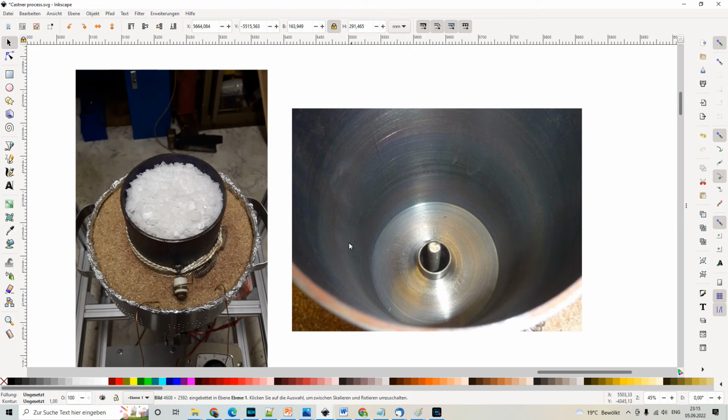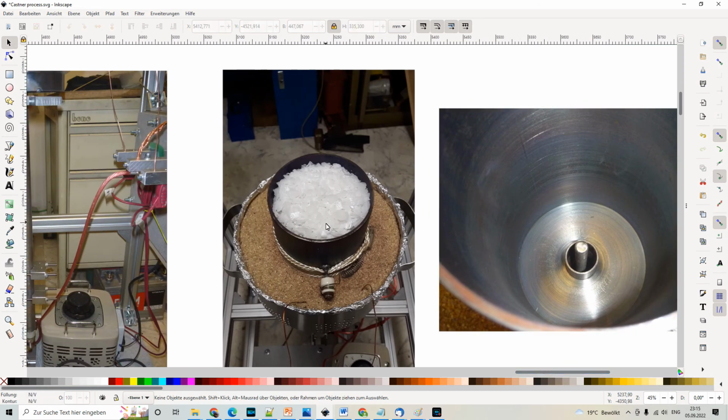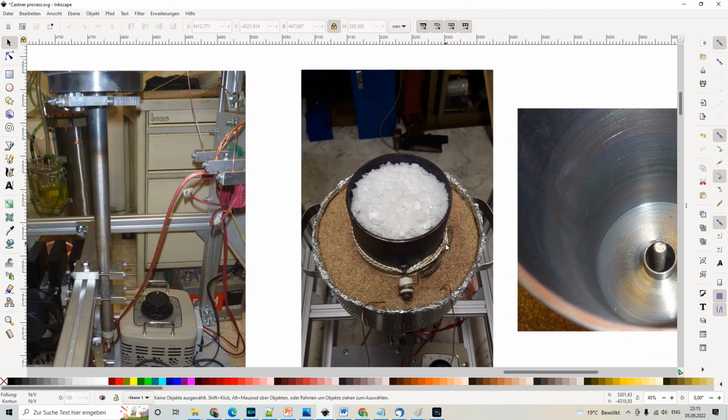So what you can see here is the bottom immersed cathode and the entire chamber. I have actually plated the entire chamber with some nickel plating in order to protect it. Here you see the cell when it's getting filled with sodium hydroxide. So I have some sodium hydroxide flakes, and I was melting that stuff. It took about 1 hour or something like that to melt everything. After it was molten the first time, the anode got inserted.